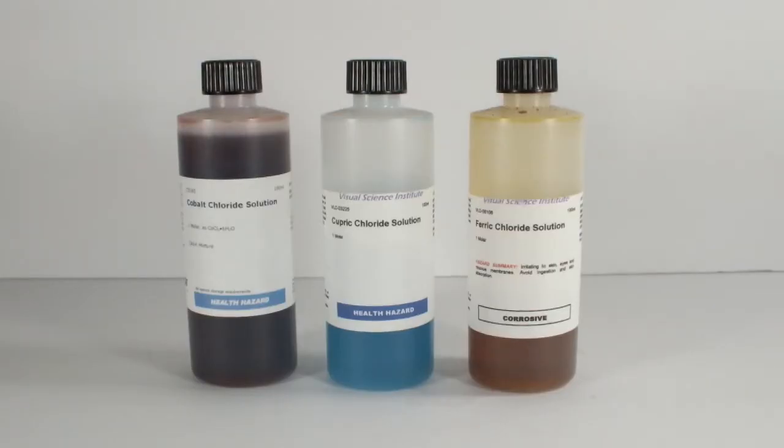I happen to have one molar stock solutions of three cations that produce insoluble phosphates. The same cobalt chloride I used in that old video, copper 2 chloride, and iron 3 chloride. I thought about using nickel 2 too, but I only have the sulfate, and I arbitrarily decided I wanted to use only chlorides.